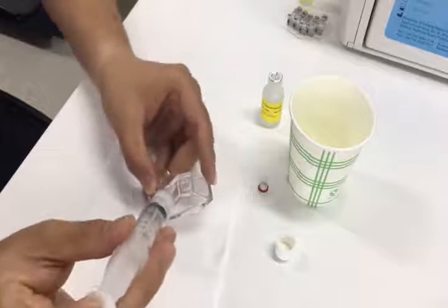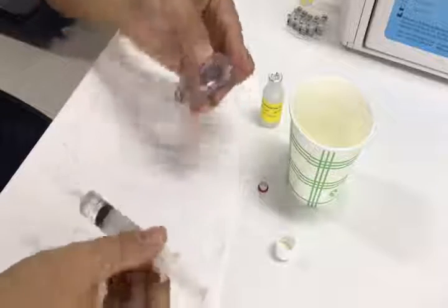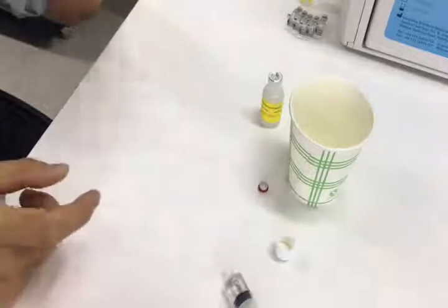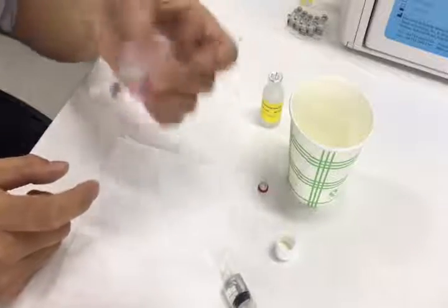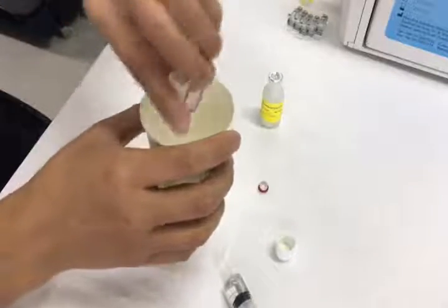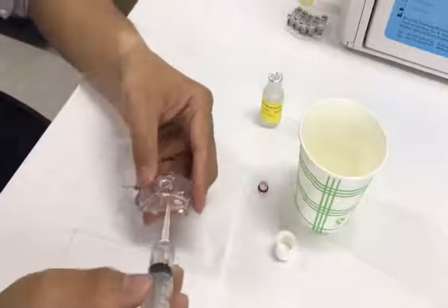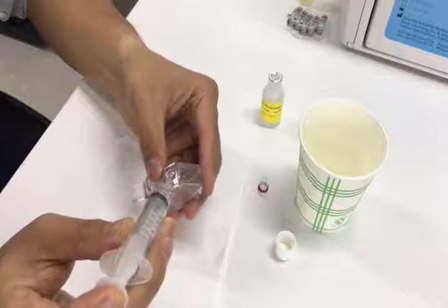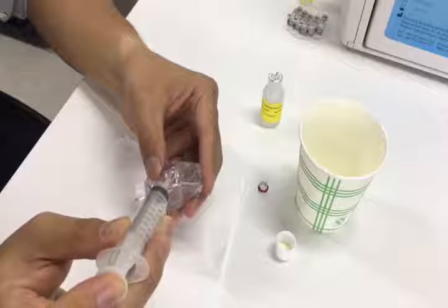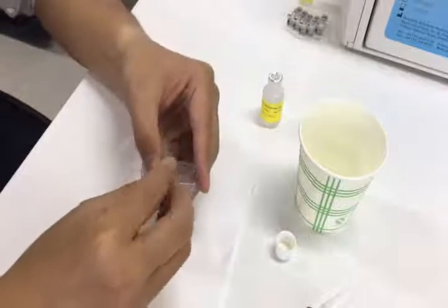Then add some solution into the cavity. First, we need to clean the inside, so clean for a while. Then we remove the solution out. Then add the rest of the solution into the cavity. Put the volume to the two-thirds of the cavity, then close the cap.